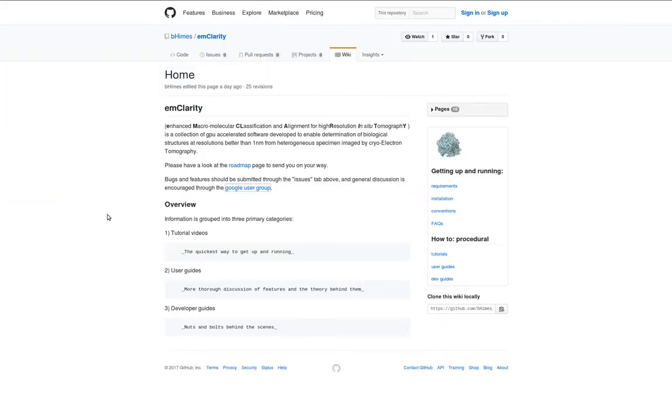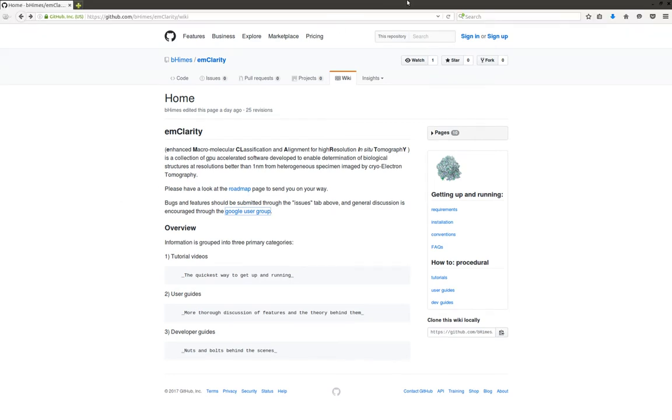And additionally, there's this wiki, which we're looking at now, which is hosted on GitHub, just behind the source code at bHimes/emClarity.